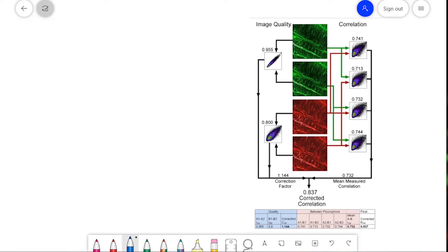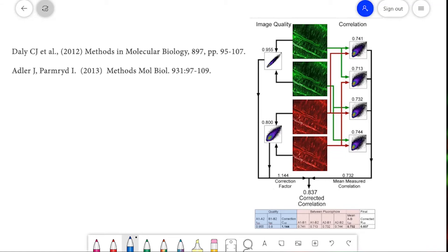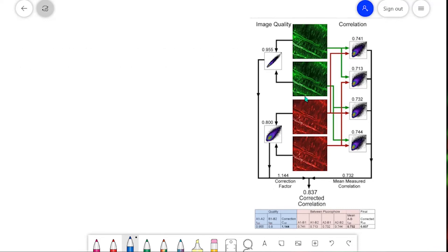This is a method developed by a friend and colleague, Dr. Jeremy Adler, and this figure comes from one of Jeremy's publications. The images here are bits of blood vessel. This image is green time point one, this is green time point two, red time one, and red time two. We collected the Pearson's correlation of green time one against green time two to get 0.955.